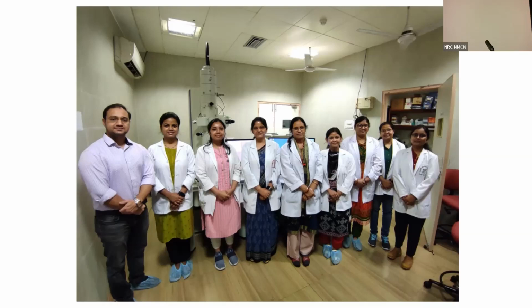Yes, you have a particular answer. Yes, it is. You see, adenomas have dense granules. You've heard about dense granules. Yes, so we have dense granules and sparse granules. So there is a role of electron microscopy: that is how you say they are dense or sparse. As I said, it's a hypothetical answer, in the way that no one will process a pituitary adenoma to look for sparse and dense granules, because now you have immunohistochemical markers which can differentiate whether it is a dense granule or a sparse one.